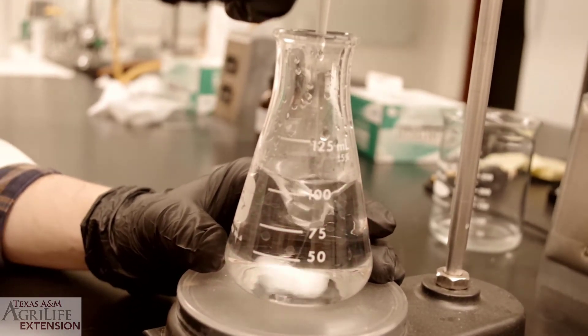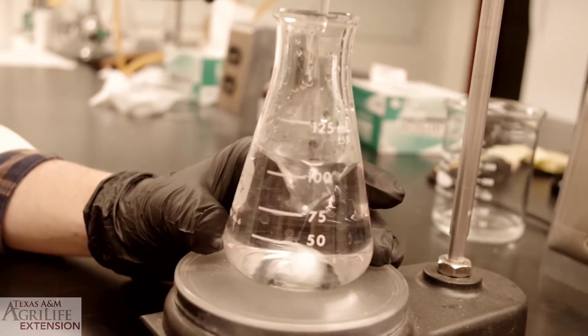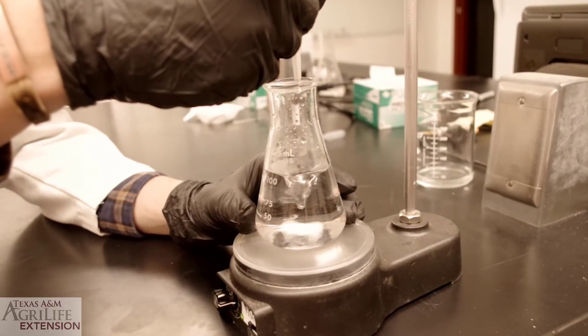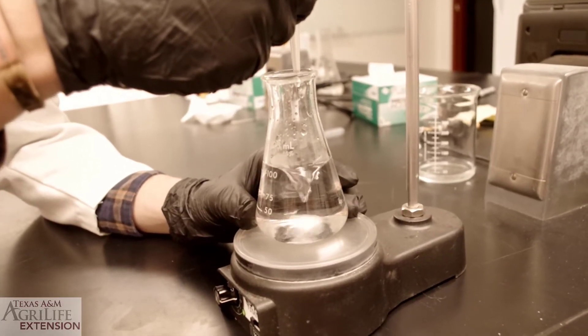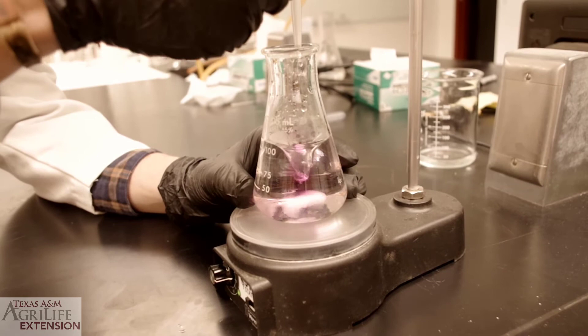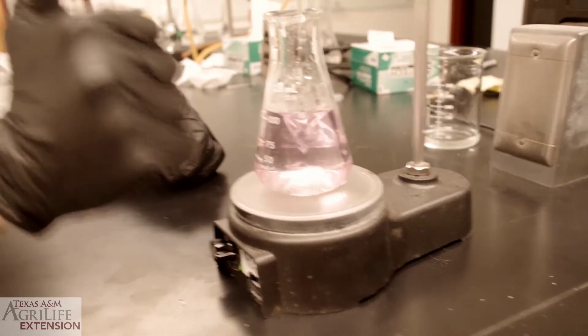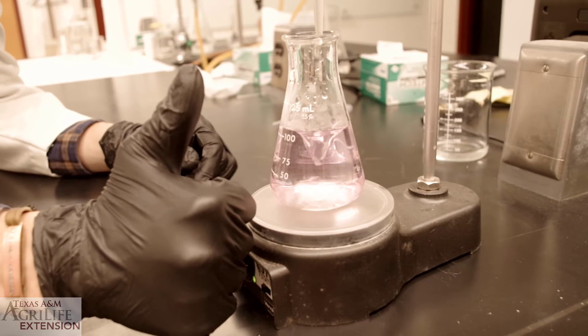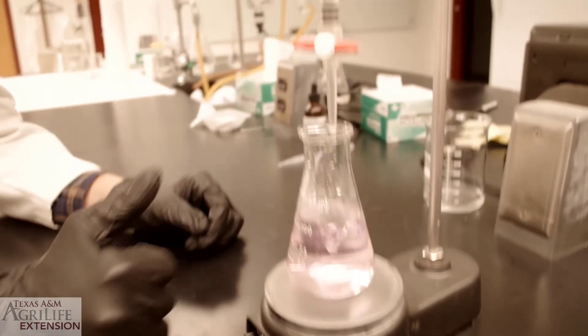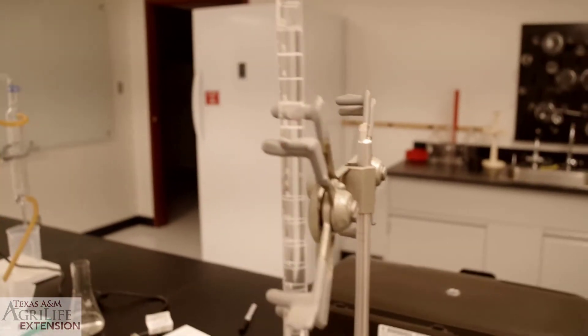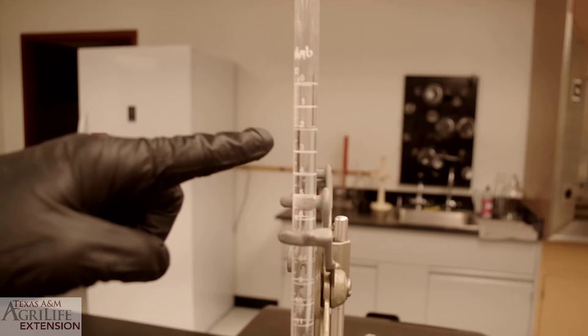We are now close to the end of our titration. Now, make a note of the total volume of sodium hydroxide used in the process. In our case, we used 2 milliliters.